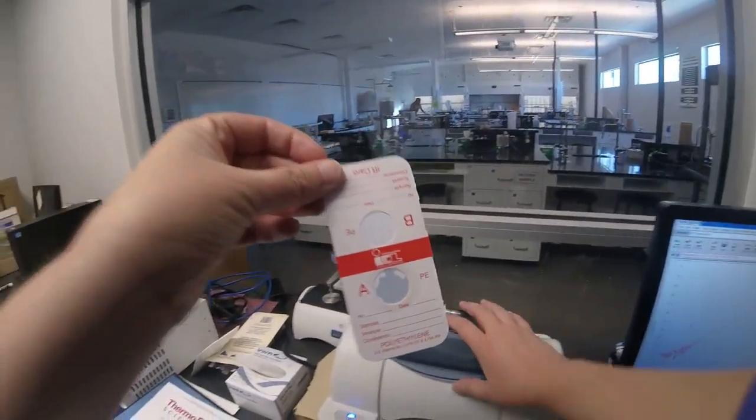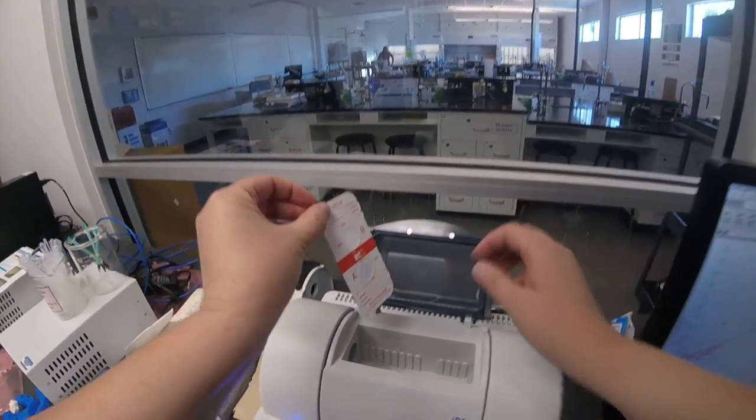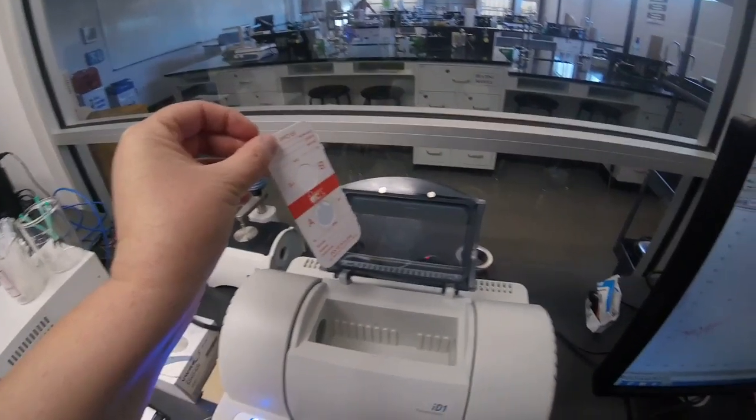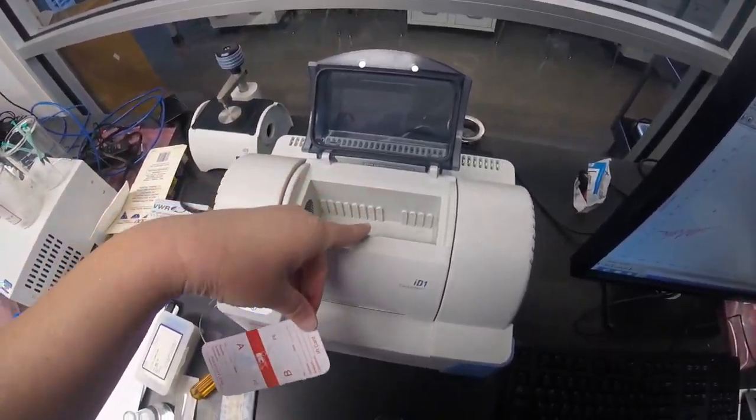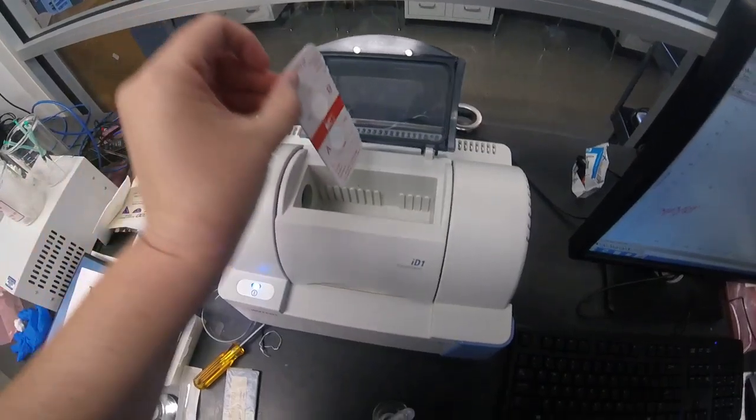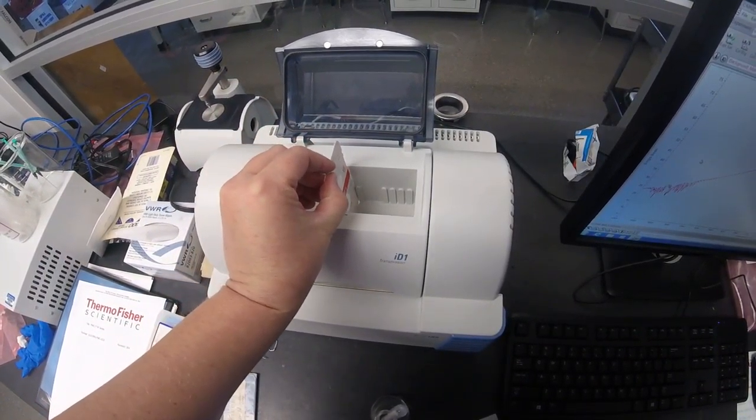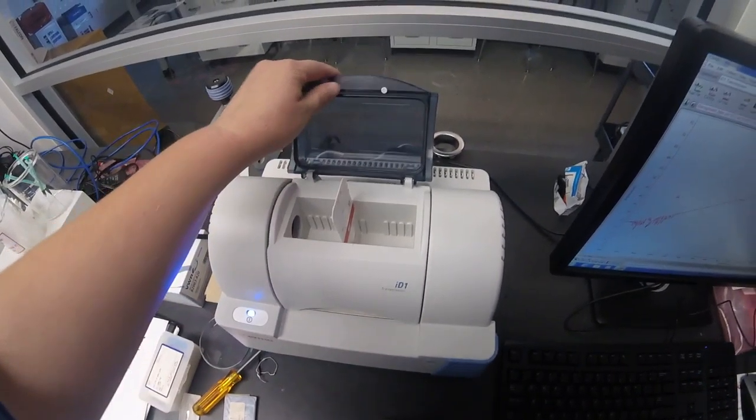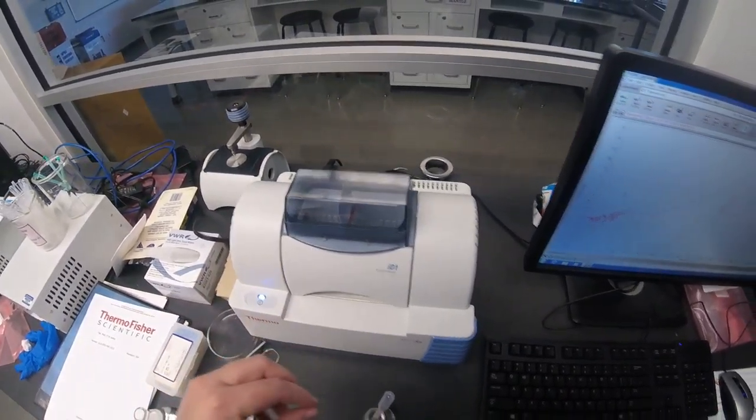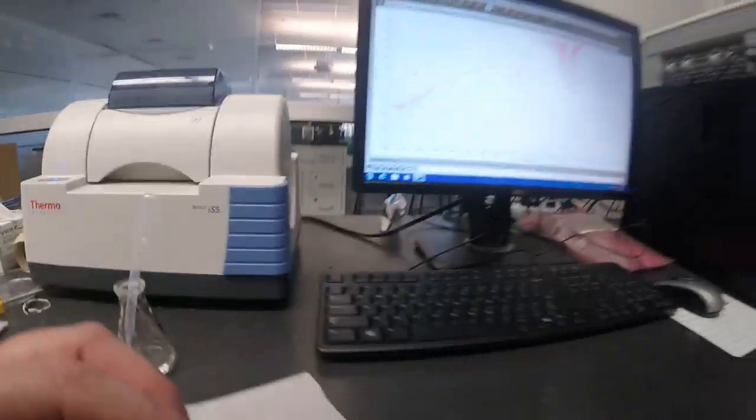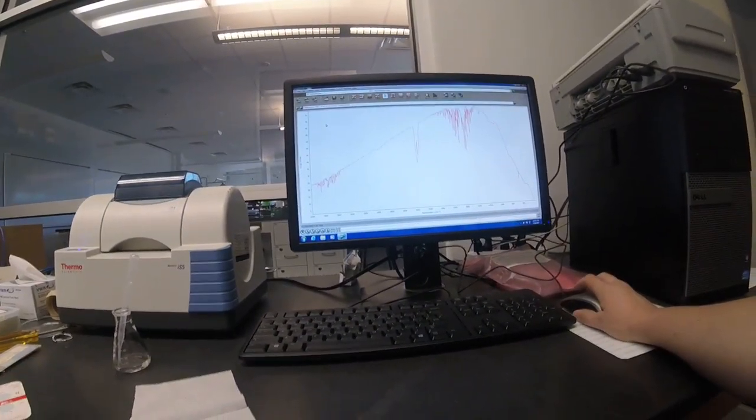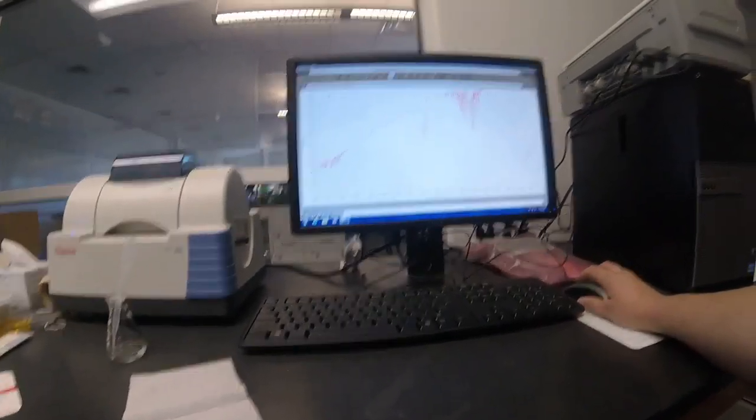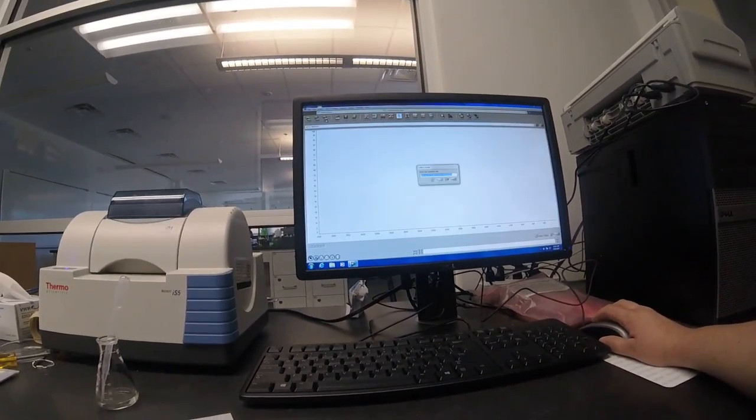And so now I'm going to take my sample, and you'll notice that there are nice little lines right here where it says put that in. I'm going to put them right between those nice little lines. And then I'm going to come back over here, and I'm going to hit collect sample.